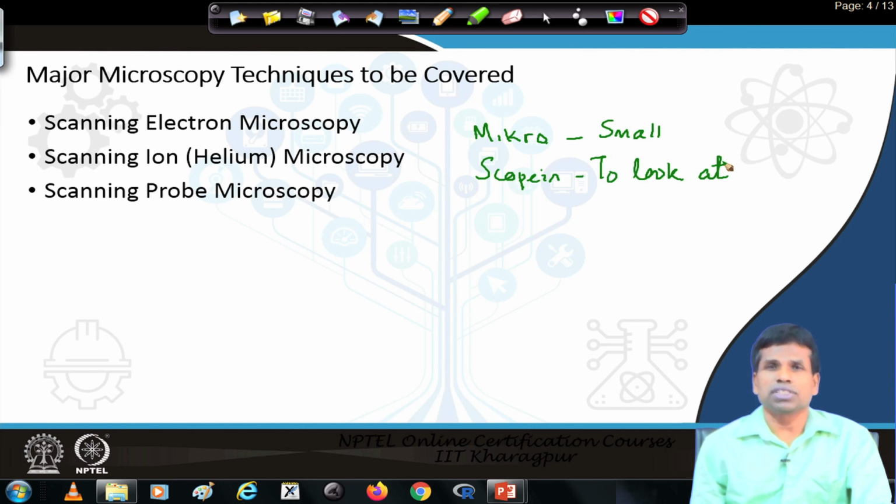If we apply potential difference between two electrodes, then the velocity of the electrons will change, therefore, wavelength will change, and we can have wavelength much smaller than the wavelength of the light. And therefore, using the electron, we are able to see objects of a much smaller size.